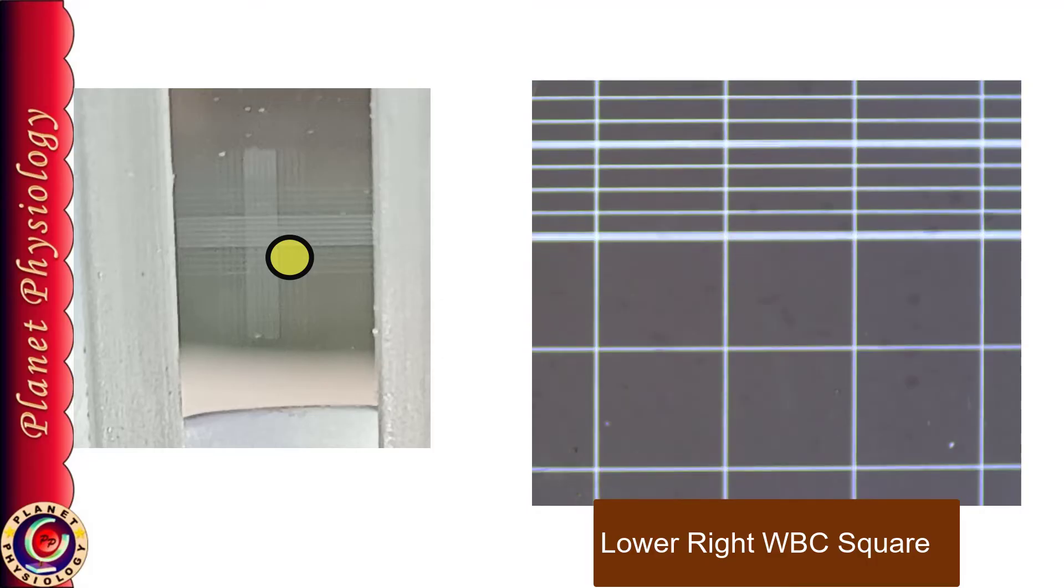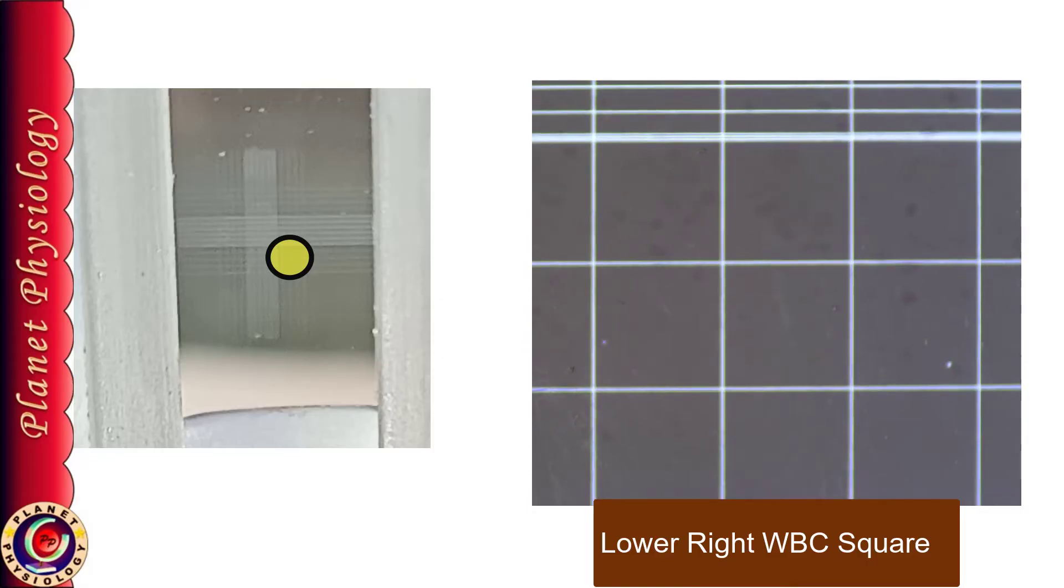So if you are focusing for WBC counting, you just need to focus any of this square under the low power objective. So you can start with any corner square.